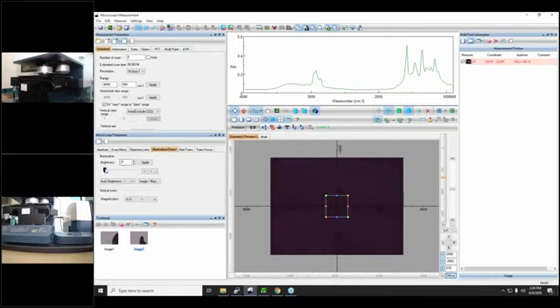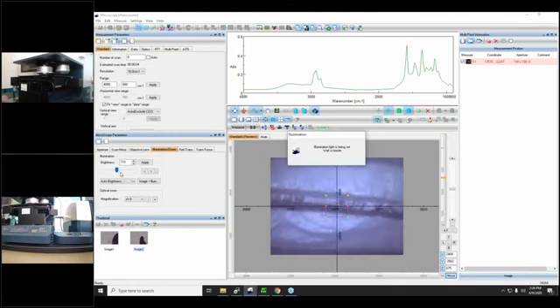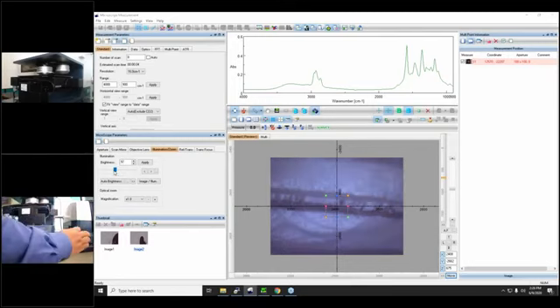Change the illumination, and we are there in our sample for ATR measurement. We can do a fine tuning there. So the two features that I want to show here are first the clear view and also the IQ mapping.